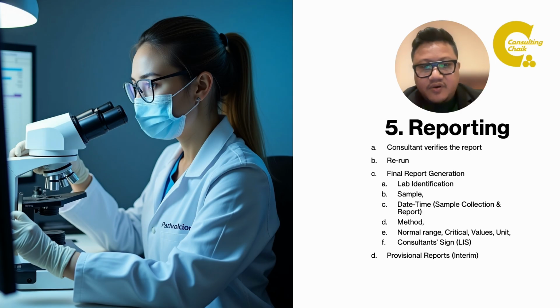In the report, lab identification must be there, the sample must be there, the date and time of sample collection, and the report should be there.